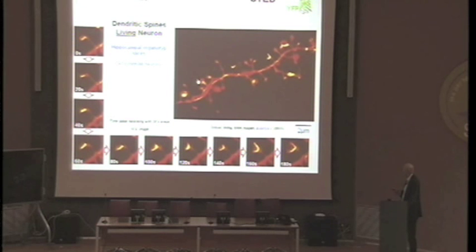And of course, one can now study, say, the spine. Well, I think most of you know that this is connected with memory formation and so on. So I think we have provided a tool that helps us get a much better understanding of what's going on at this scale for neurons. Of course, there is tissue also here and here, but there's only one neuron that is labeled. This is why we see this neuron in here.